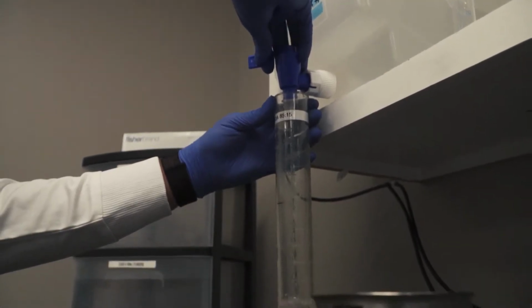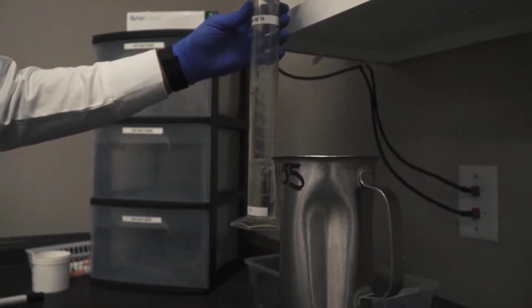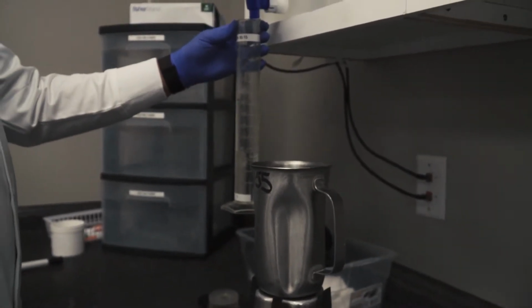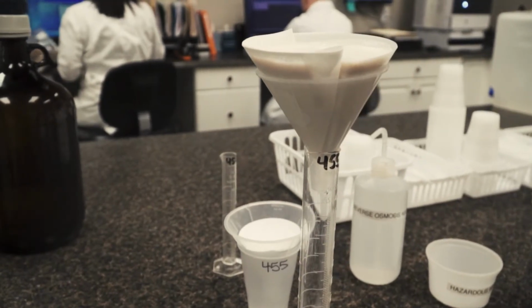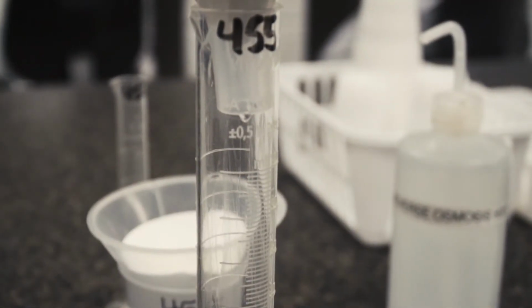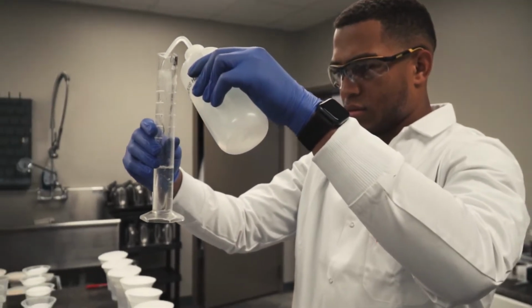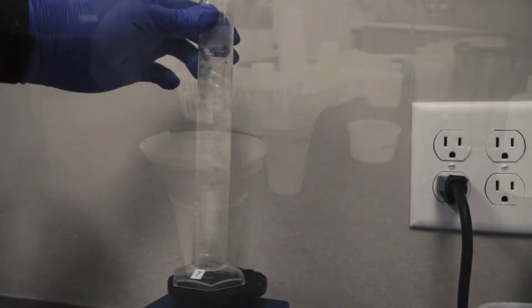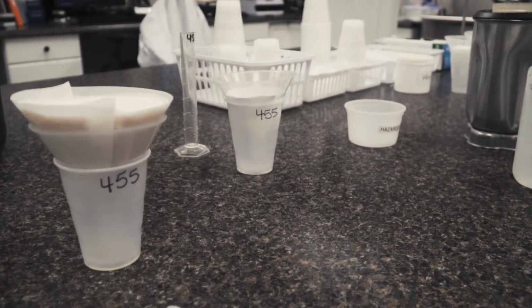Next, methanol water extraction solvent is added to the sample, which will release any aflatoxin present in the slurry into the sample extract. After blending, the sample extract is filtered through a paper filter to remove the larger particles. The filtered extract is then diluted to volume with water. The extract is mixed well using a vortex mixer and filtered once again through a 2.4 micron glass microfiber filter to ensure clarity of the sample.